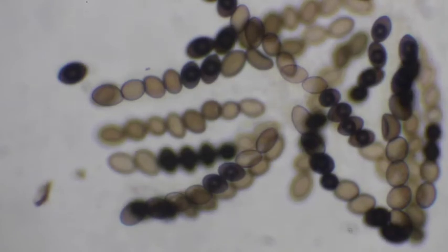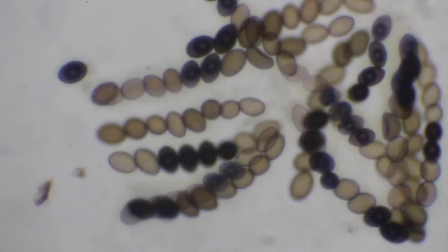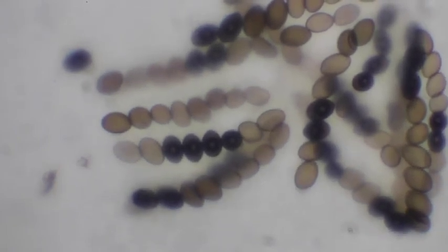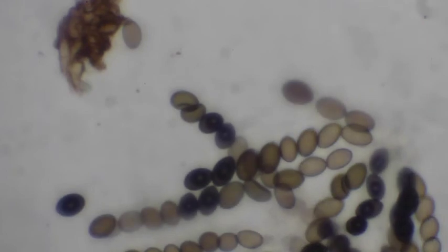There's 2 that we can see 8 cells in. But if you can recognize any and get them fully counted, then you want to record those individuals in there. Okay, and I'm not quite able to get full. There's a 4, 4. All right, I'll stop it and go elsewhere.